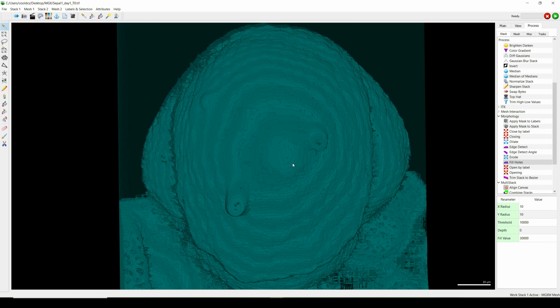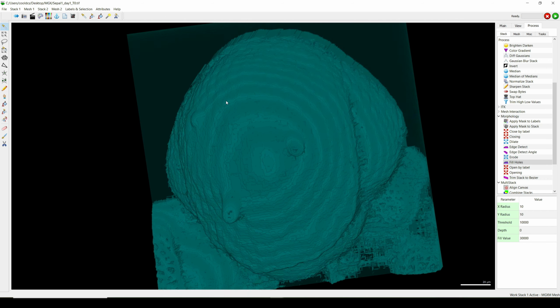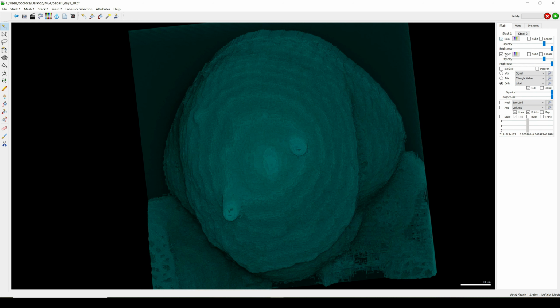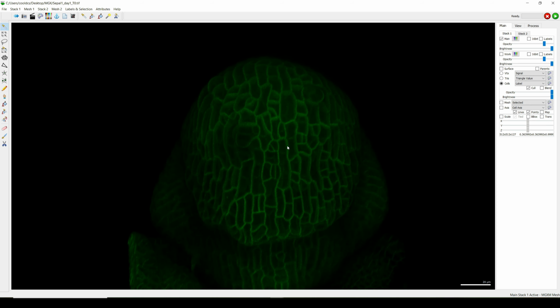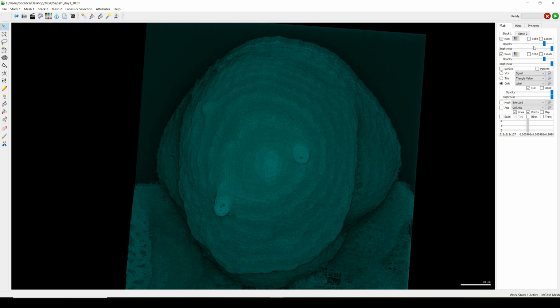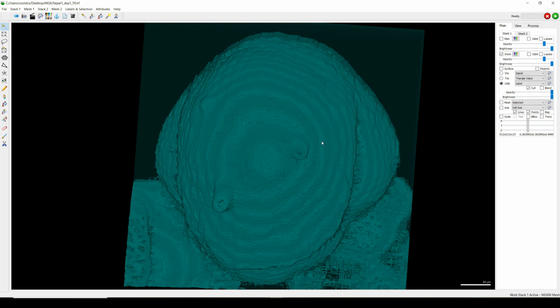You see that working directly with the original stock, it gives kind of good surface detection, but you see that the surface is quite rough, not smooth at all. Why? Because the signal is not really smooth, and on the surface of cells you have some noises. One way to have a really good surface detection is to smooth out the original stock before feeding it into MorphoGraphX, and I will show you how to do it.